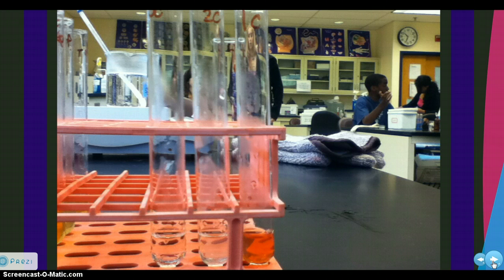In the first test tube, we added catechol. In the second one and the third one, we didn't, which is why they became negative controls. Otherwise, they'd all be brown. I fumbled that badly, and I apologize.